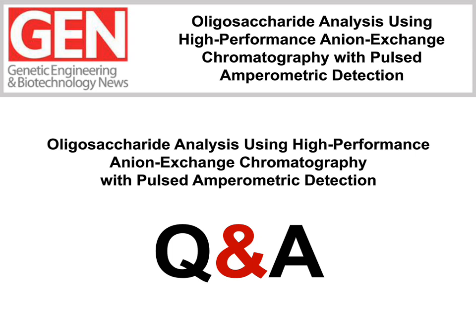I would refer anybody that's interested to our application update 176, where we talk about preparing PNGase F digests for HPAE-PAD, and that specifically discusses the Triton X100. Okay, Jeff. Some oligosaccharides are negatively charged already. Do I still need to have sodium hydroxide in my mobile phase?